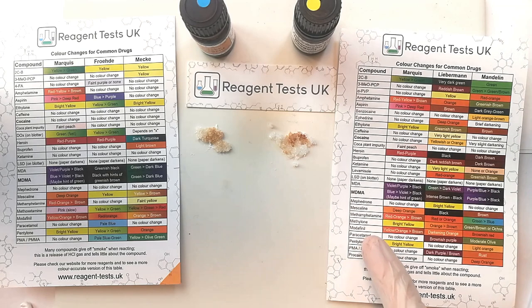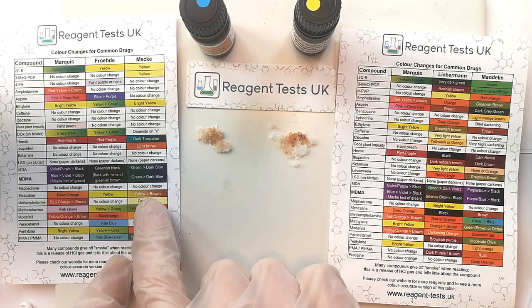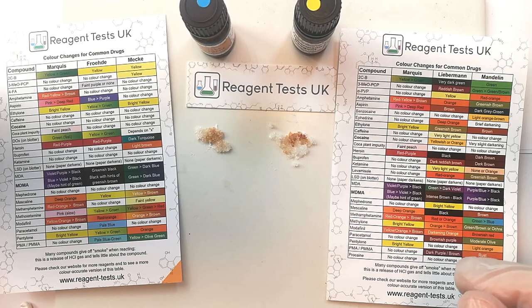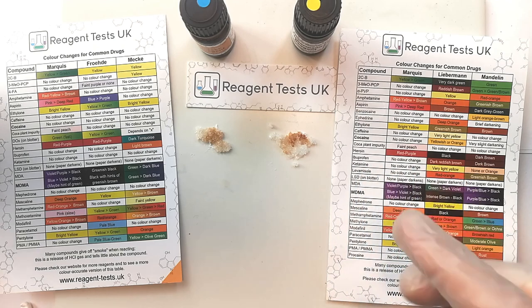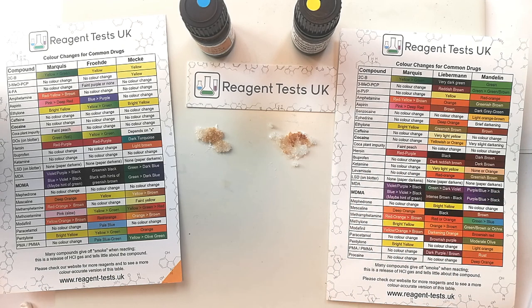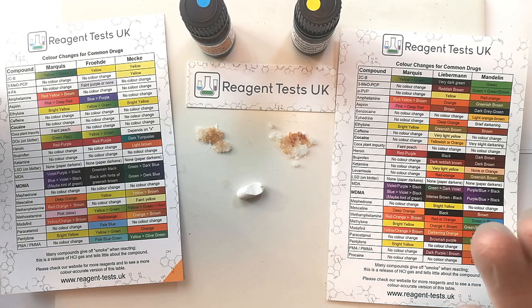Let's work upwards. Modafinil would give us a darkening orange colour change, and we can see that that's not a darkening orange colour change, and therefore this is not modafinil. Mescaline with the Lieberman reagent would give us a black colour change. So although it matches with the first Mecha reagent going brown, it doesn't match the second reagent, and therefore we can say with confidence this is not mescaline. Ibuprofen gives us a dark reddish-brown colour change, and so that does match with the expectation. So the only substance that matches both — and it must match both — is ibuprofen.